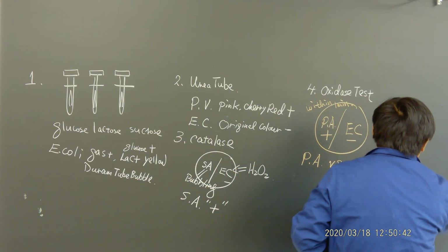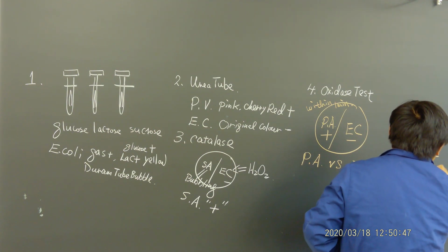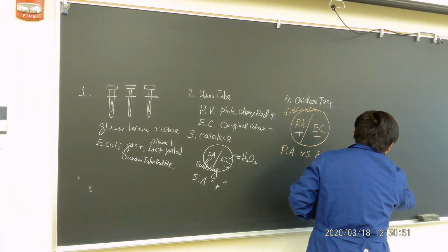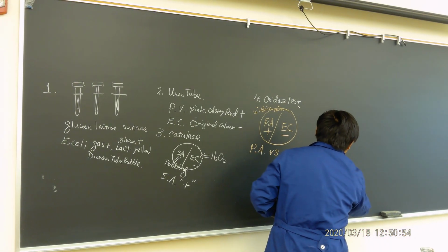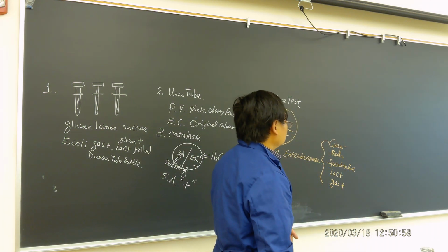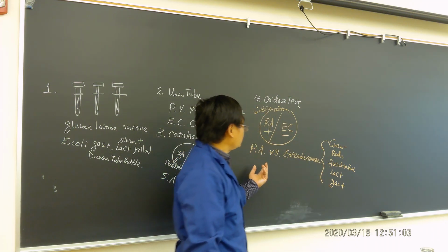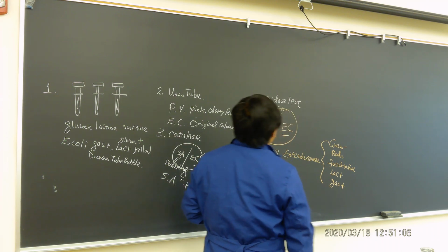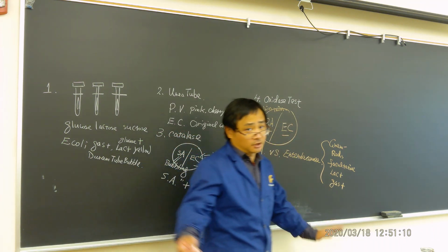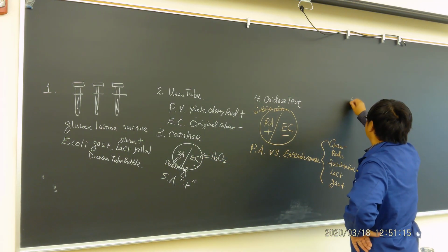The reason is all these bacteria are gram-negative, rod shape, facultative, lactose fermentation positive, gas fermentation positive. So it's very difficult to differentiate them. That's why we use the oxidase test. It can be a very easy identification clinically, okay? Okay, that's good. Now number 5.